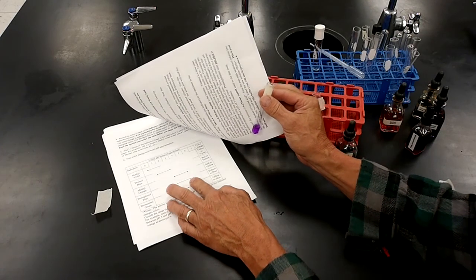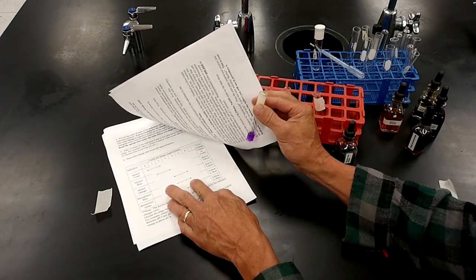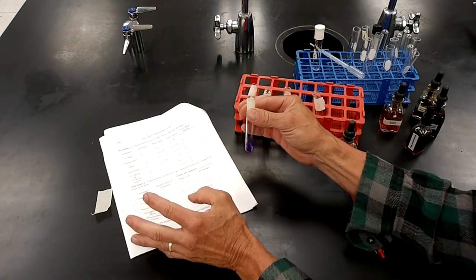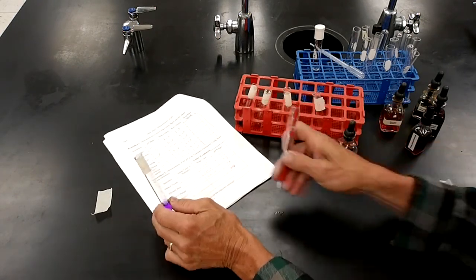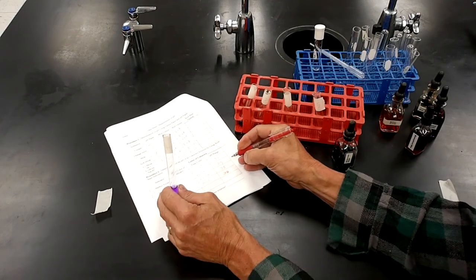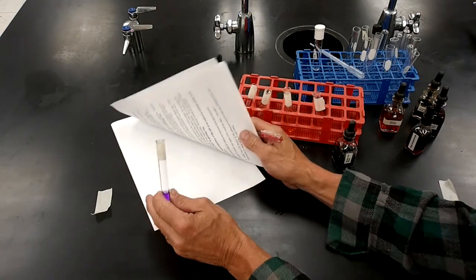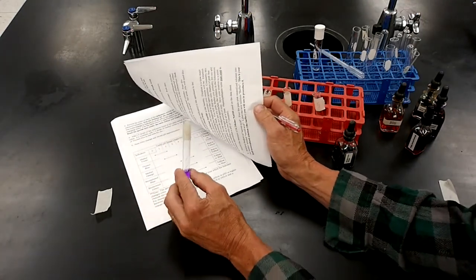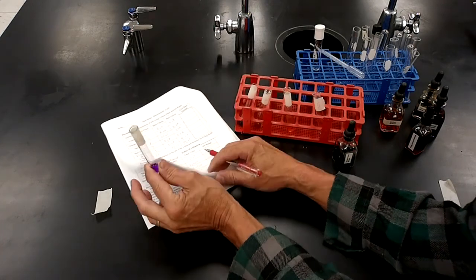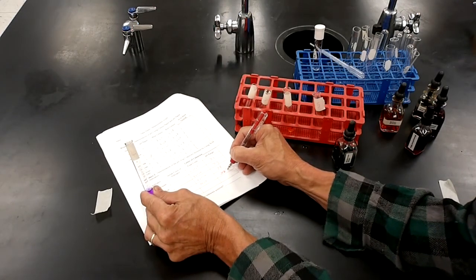Blue if it's around 5 or 6, above 5. So I'm going to call that blue. Which means greater than 5.